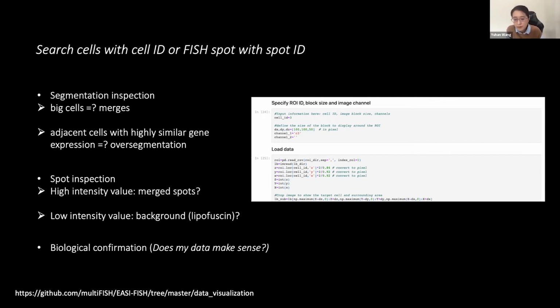Right now, this is kind of pieces. I would love to have this as part of the pipeline. I think this is something we hopefully would have a chance to work on. It's not too difficult, but this is, I would say, semi-automated.